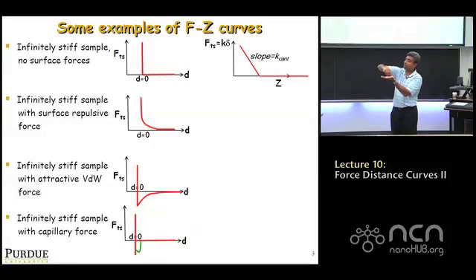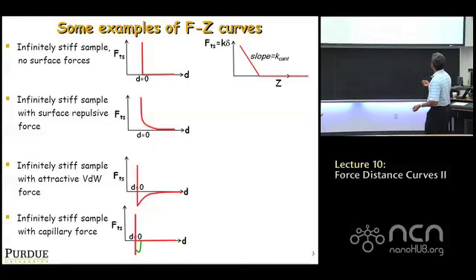So this is initial contact, and then I press Z down, let's say 10 nanometers. Well, this tip relative to the base of the cantilever goes up by 10. So what we measure in an AFM experiment is we change Z. Z can keep changing, up and down. But D remains 0 all along.